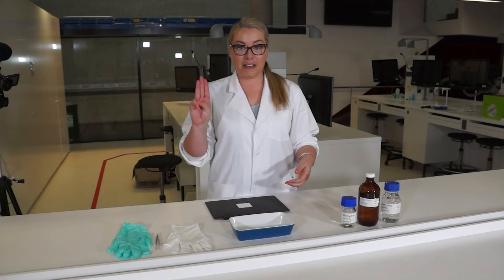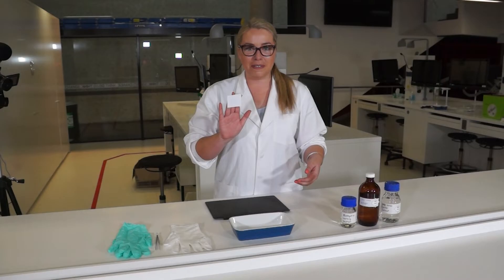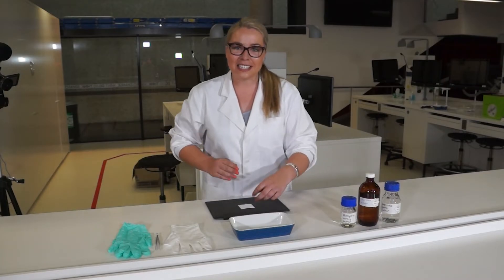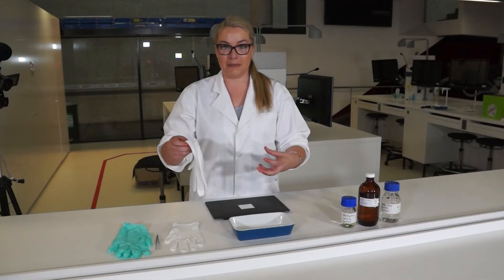I'm taking three fingers and I'm going to place them on the paper. As you can see, because I have fingerprint residue on my fingers, the paper actually sticks to my hand. And that's what goes into the paper and that's what we're going to be developing.